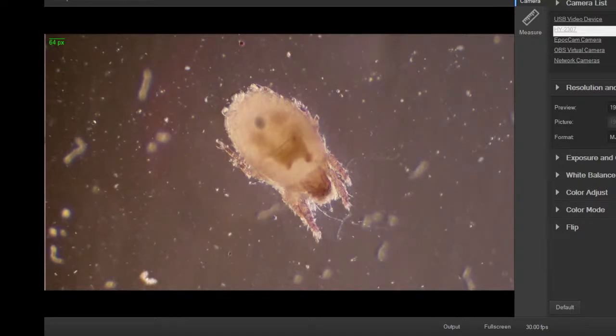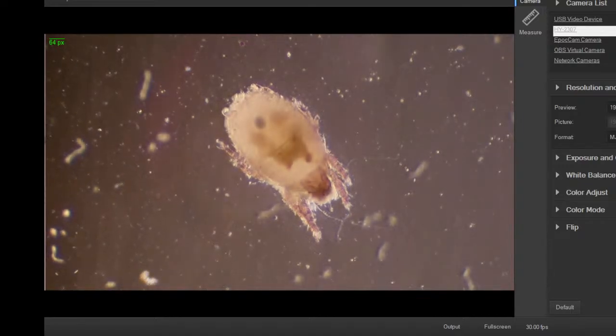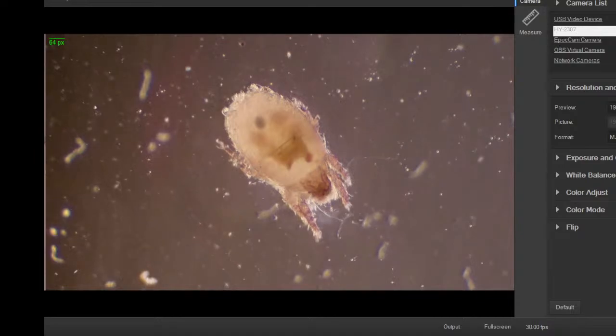Ticks have... looks more like a mite than a tick. It's been a while since I looked at a tick. Mites generally have these chunky, bristly legs, and ticks are very clean looking, more like a spider that doesn't have hair on it. Some spiders are pretty clean, they don't have a lot of hairs on them. And it's got this chunky body. Not sure where this guy came from, but it's got a little bit of reddish color to it.